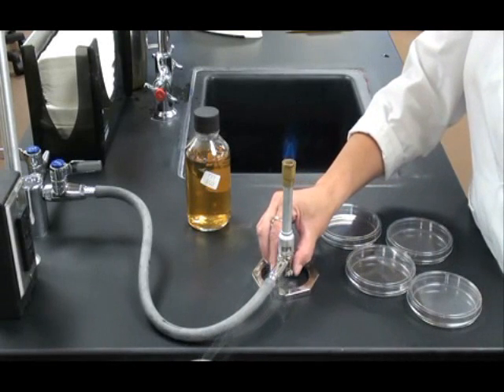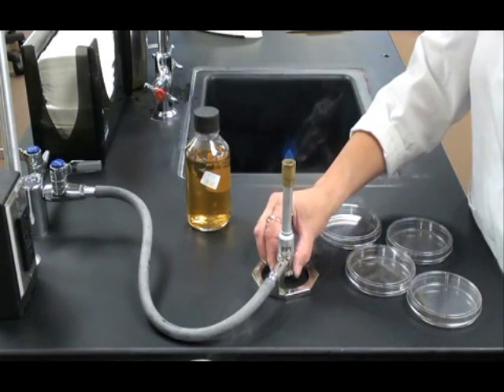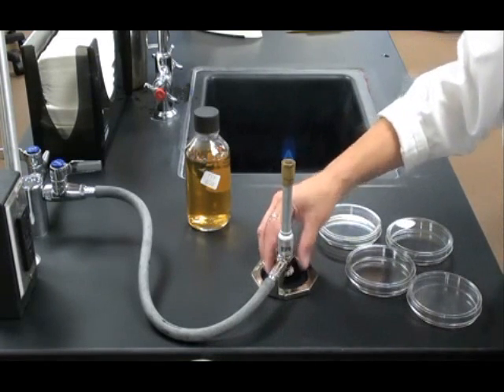I can adjust that flame with the cog at the bottom of the Bunsen burner and I want a small bright blue cone.